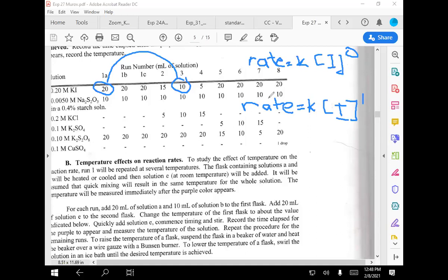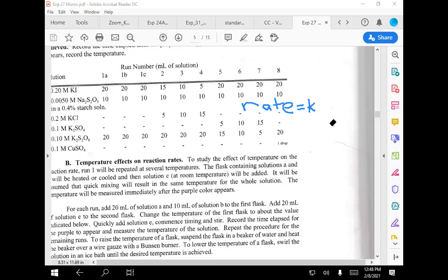It would be, but we don't know that yet because you haven't played with your data yet. We're trying to see how you could look at the data and figure out the rates. So we're pressing all these different buttons to see what's changing. That's kind of what we're doing. We could compare test tube 1A and test tube 3 and get an idea of what's happening.